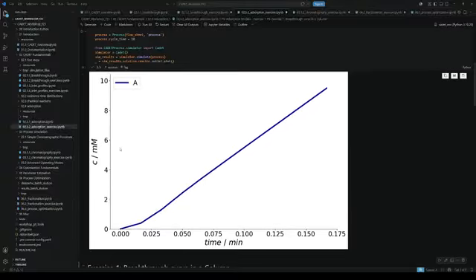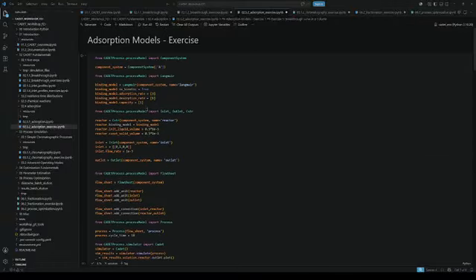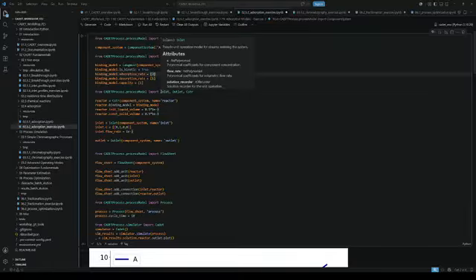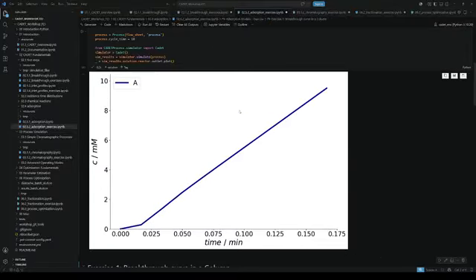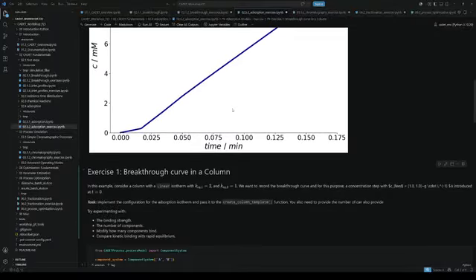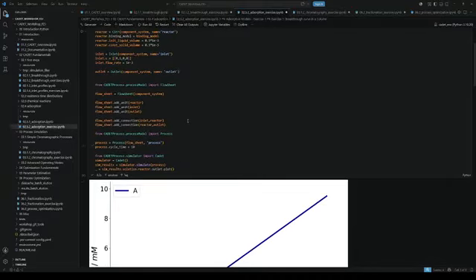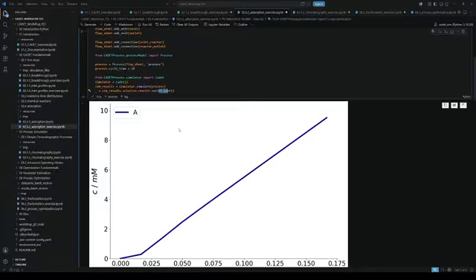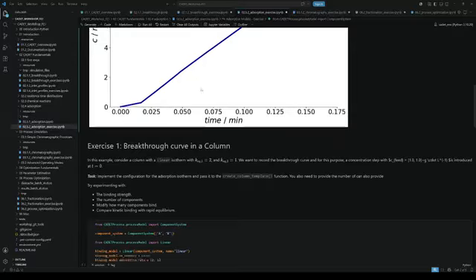And now we can see that over time the concentration in our system is increasing. Maybe now we play around a little bit with the adsorption parameters, and setting this up, we have now this full component system with an outlet of our reactor, right? So over time, the outlet concentration is a little bit higher because molecules are accumulating.